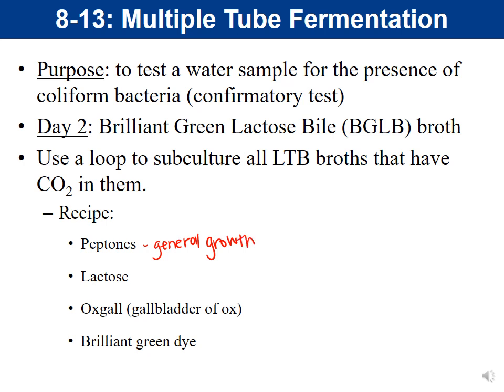So this is our food for general growth. So that's our peptones. Next, we have lactose. Lactose is there for fermentation, to detect coliforms.